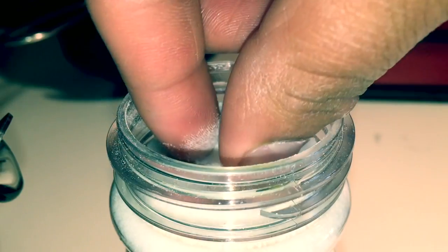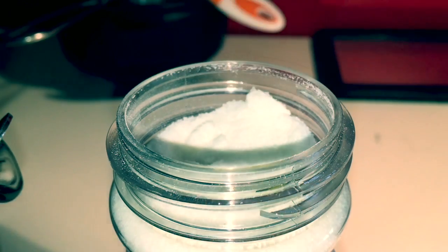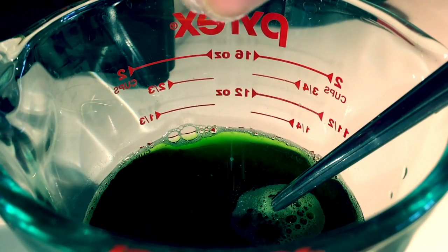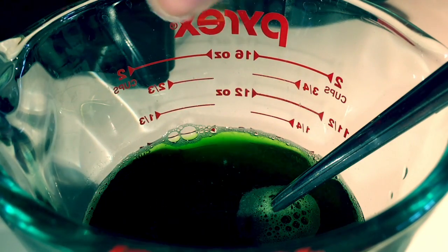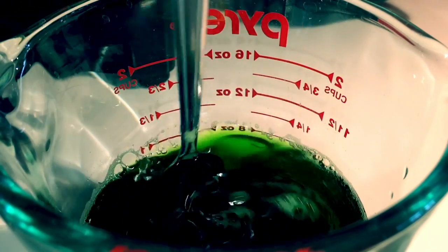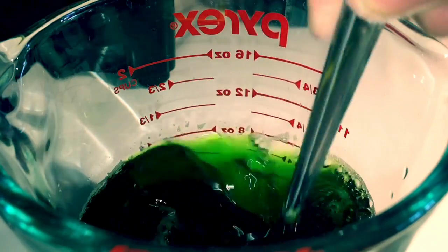Once the 10 minutes are up, add a pinch of meat tenderizer to your green mixture. Make sure to add this evenly and slowly. Use a spoon to thoroughly mix the meat tenderizer into the green mixture.